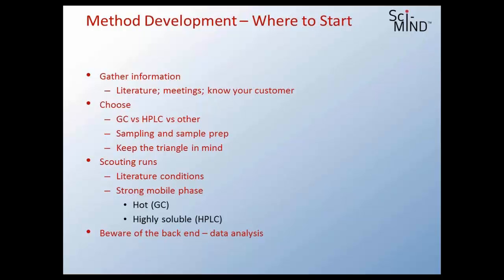And what I've learned about my customer. Who's going to be running this sample? Do I need to develop an easy method, or can they handle something more complex? Finally, and we didn't do a lot of examples of this, but I like to start off our method development really doing scouting runs. That's one of the places where that literature work helps me.